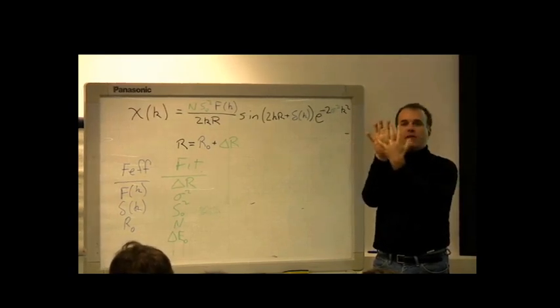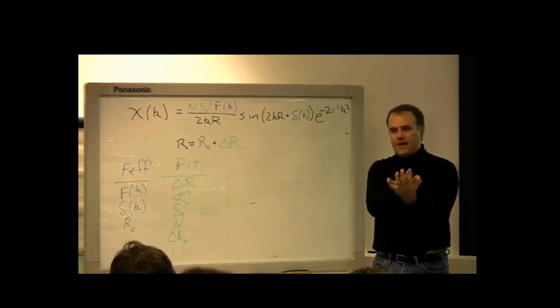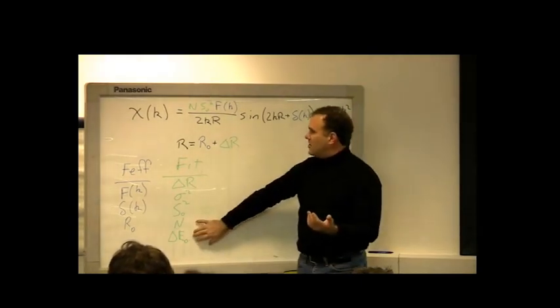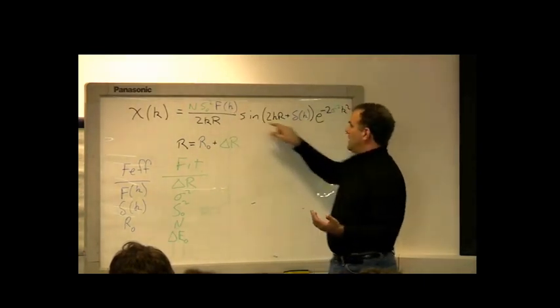So we need a parameter in every fit to line up the energy grid in the theory with the energy grid in the data so that the rest of the parameters can be determined correctly. So you will find that we always have a delta E naught that affects the evaluation of k everywhere it appears in the EXAFS equation.